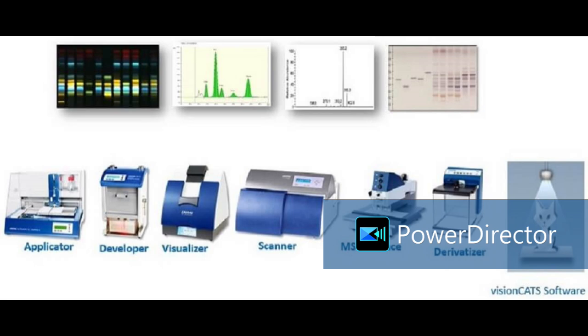While going into MS, the silica particles coming out from the plate get filtered out here. So only this band with your solvent goes into MS. Suppose there are 1, 2, 3 bands on the plate and we want to find out the molecular mass of the middle band. We can focus on that and elute this band into the mass spectrometer. That is the function of the TLC-MS interface.